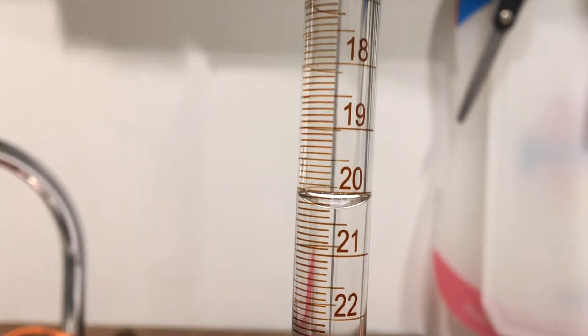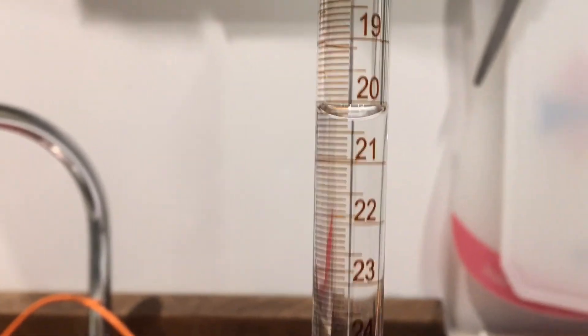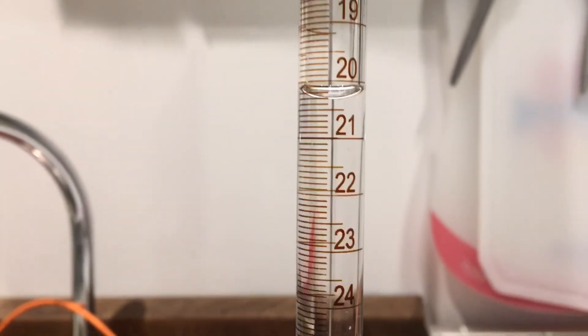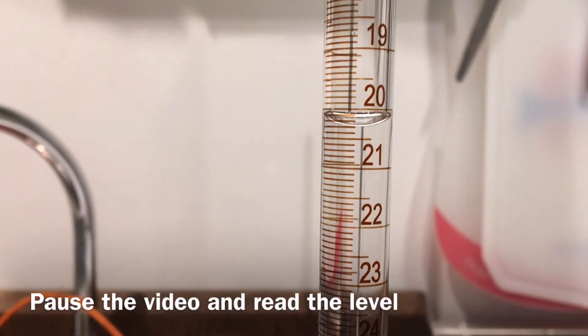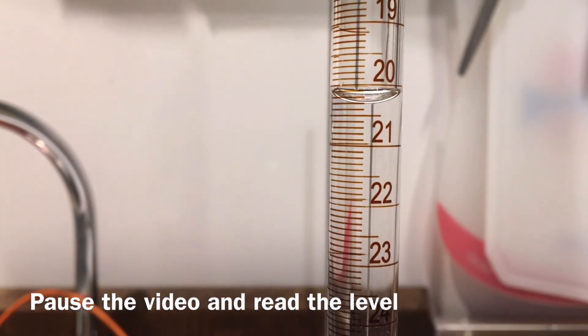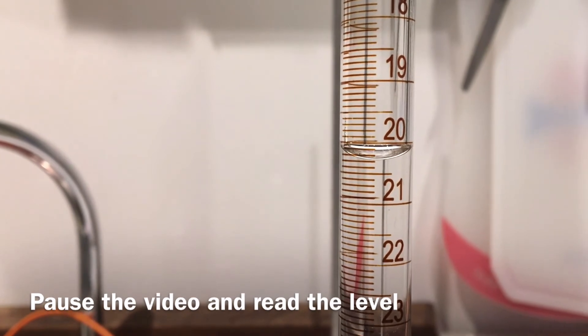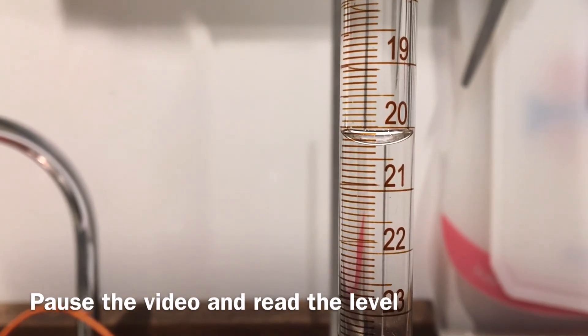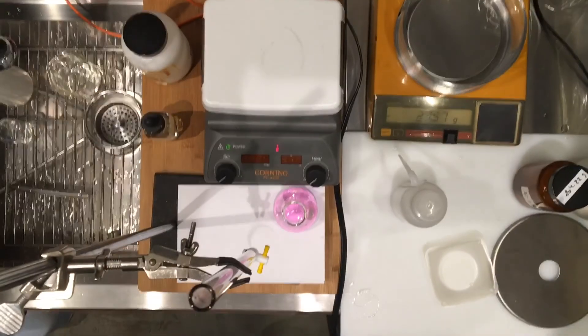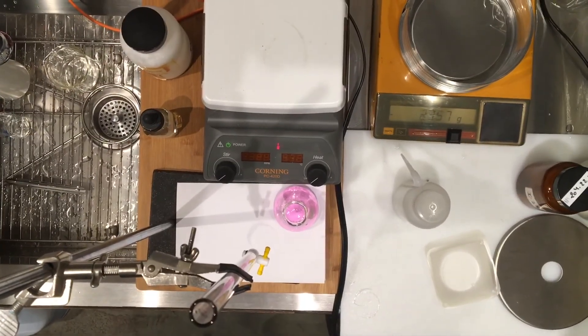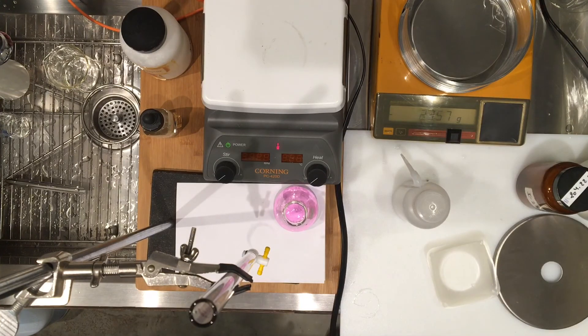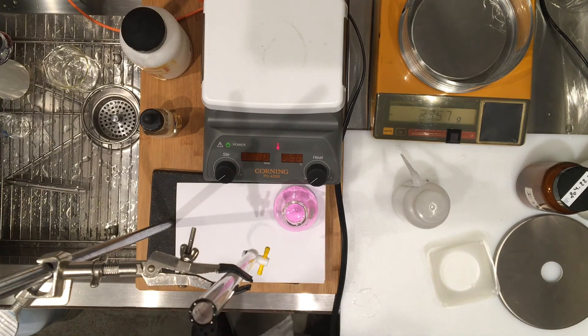Which is down to the hundredths of a milliliter, so you have to estimate the last digit. I'm going to get this thing just right for you because it has to be really parallel. Go ahead and read it. I'm going to let you record that, and this volume of sodium hydroxide together with the 0.411 grams will allow us to calculate the concentration of the sodium hydroxide.